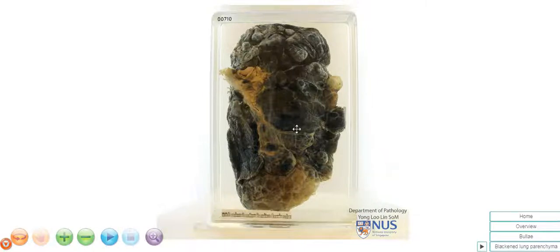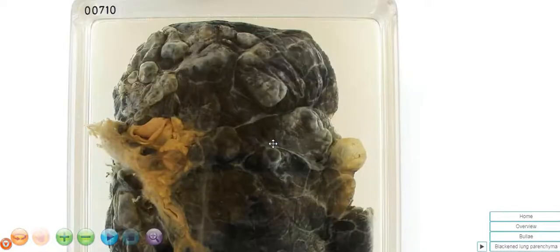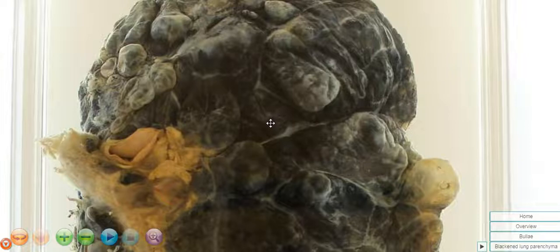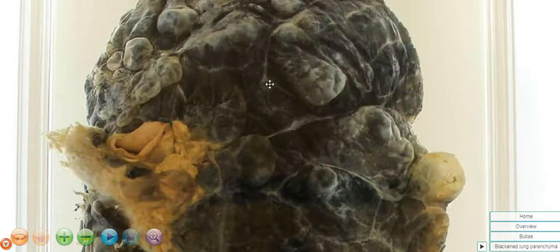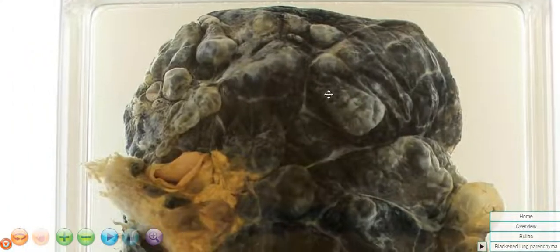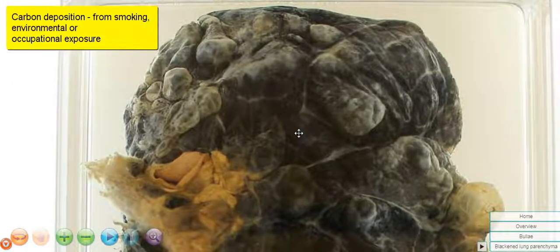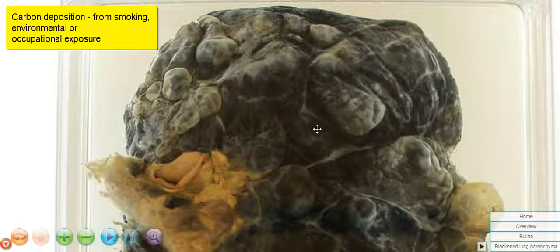Hello, this is a specimen of the lung and we're looking here at the pleural surface. We can see first of all that the lung is actually rather dark in color, it's quite black in many areas, indicating that there is probably carbon deposition in the lung and therefore this potentially may be a smoker.